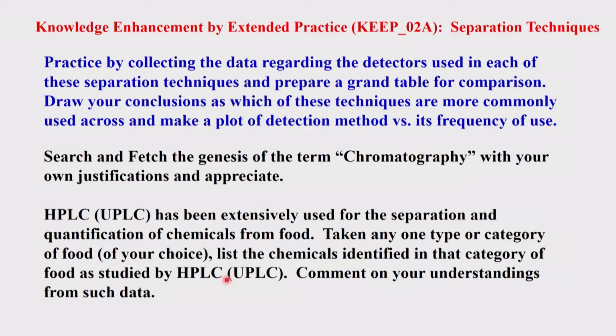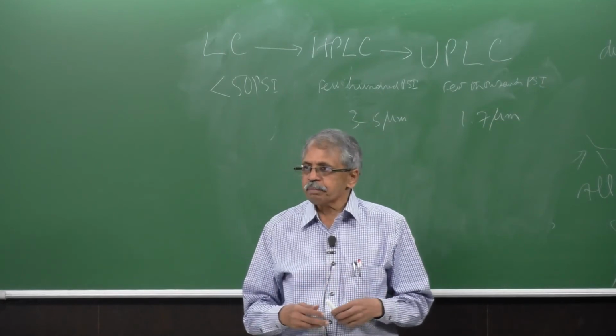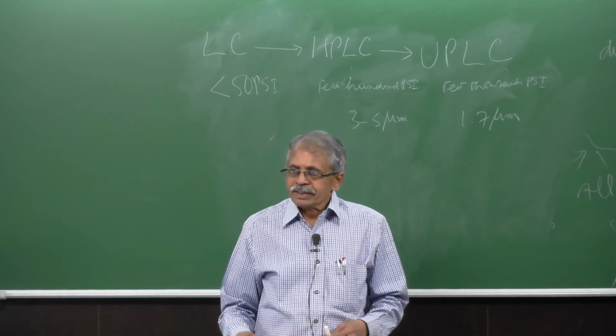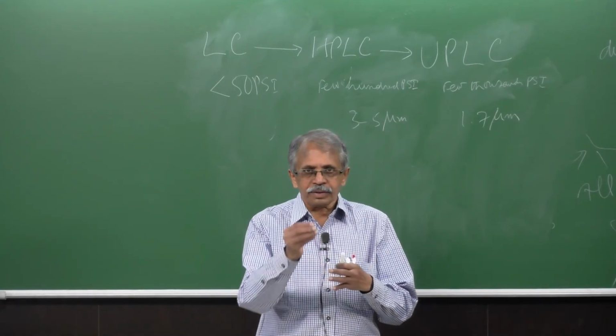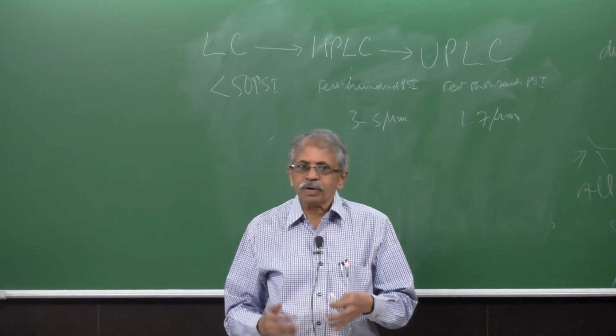Okay. So with this I would like to draw your attention to get yourself more acquainted with the system of chromatography, with the knowledge of chromatography, so that you can enhance your knowledge by extended practice of this operation. Okay. So practice: I have already given you a little bit on the detectors, but many more things are there. So what I wanted to ask is, how will you practice these things?